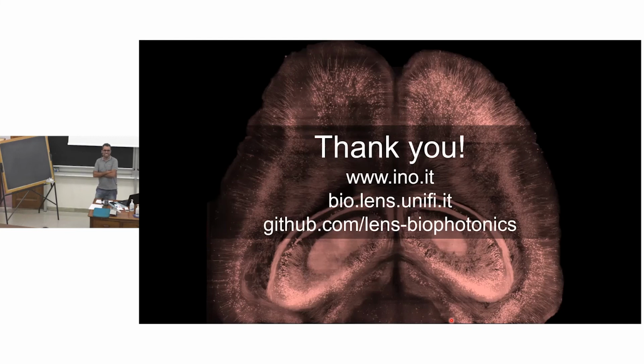The question for the recording is how often do you do the scans, and how much data you already have and how much you expect to be getting in the future? I would say that in some periods, we do a mouse brain almost per day. And so this should give you a number of how many brains we deal with, many. Because, for example, some colleagues of mine are doing studies on fear memory, how the memory of fear develops. And so they have mouse that are trained to fear, for example, a particular portion of their cage because they get a small shock.